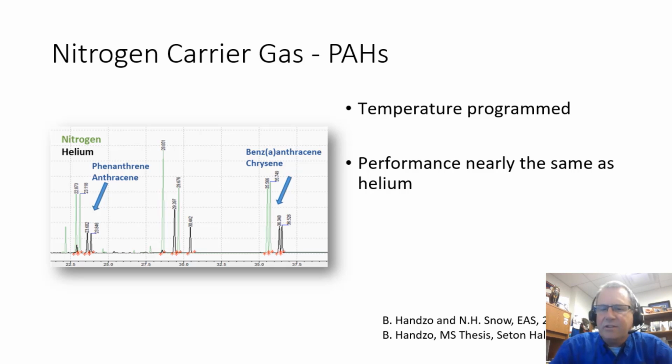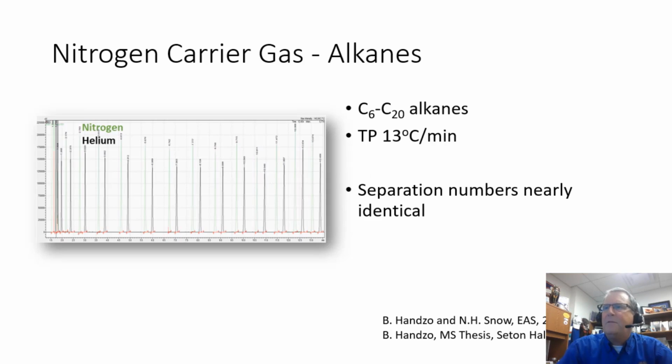Again, EAS 2019, my lovely videos covering that up, and Brittany's master's thesis that you can download from Seton Hall. And it's a free download. You might want to look at that if you're considering nitrogen or considering carrier gases. Take a look at Brittany's master's thesis. It's a free download. But we found pretty similar performances, and also in temperature programming.